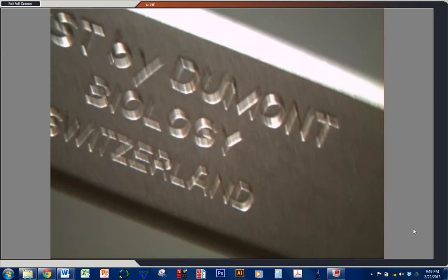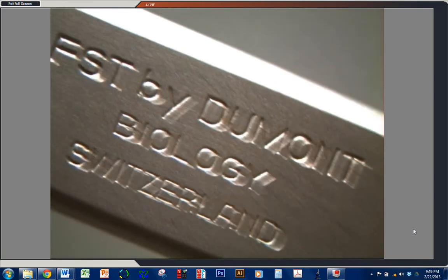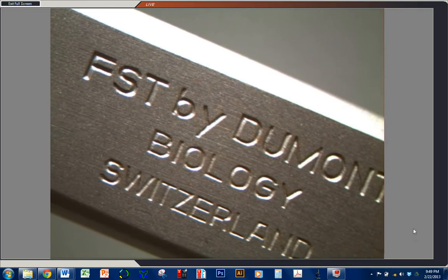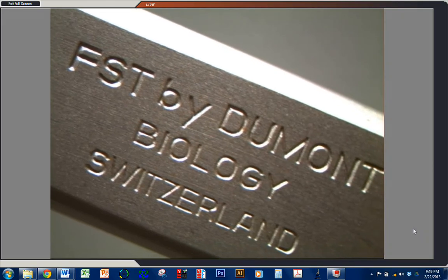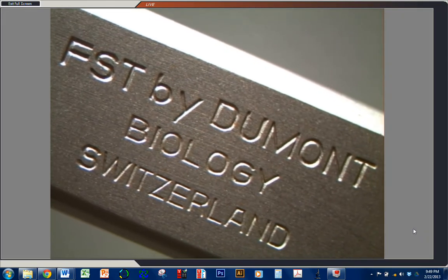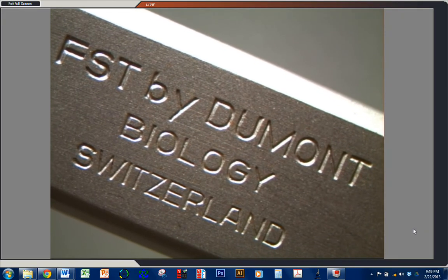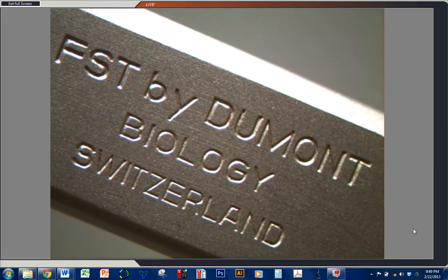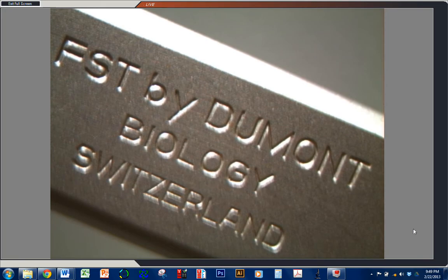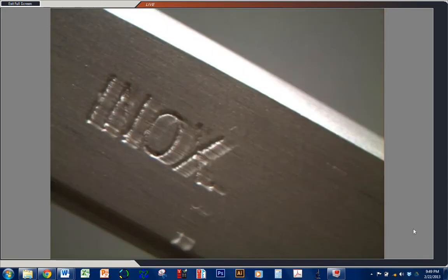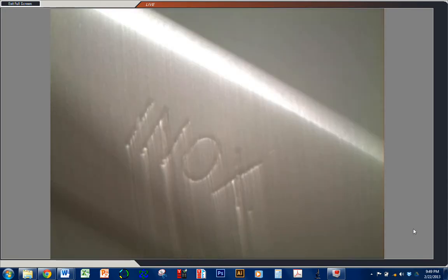To start off I'm going to tell you a little bit about the tools that you'll need. First thing you'll need are two pair of tweezers. We use Dumont number fives from Fine Science Tool with Inox Alloy.